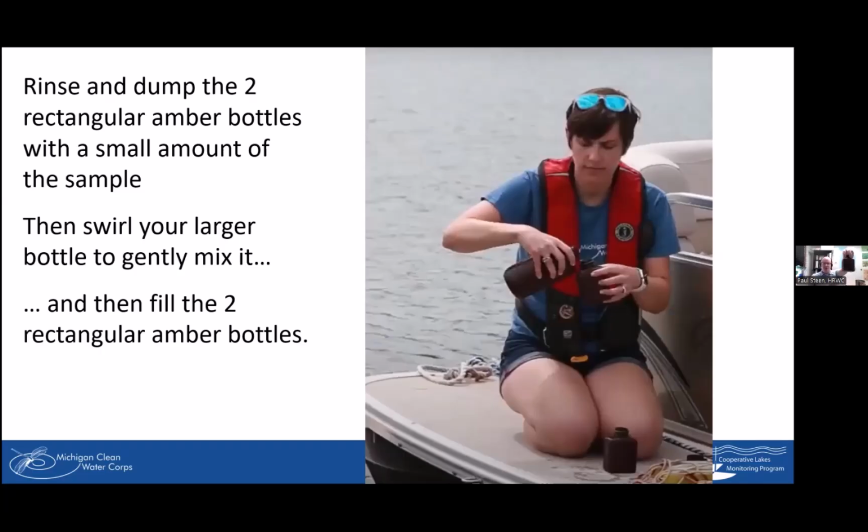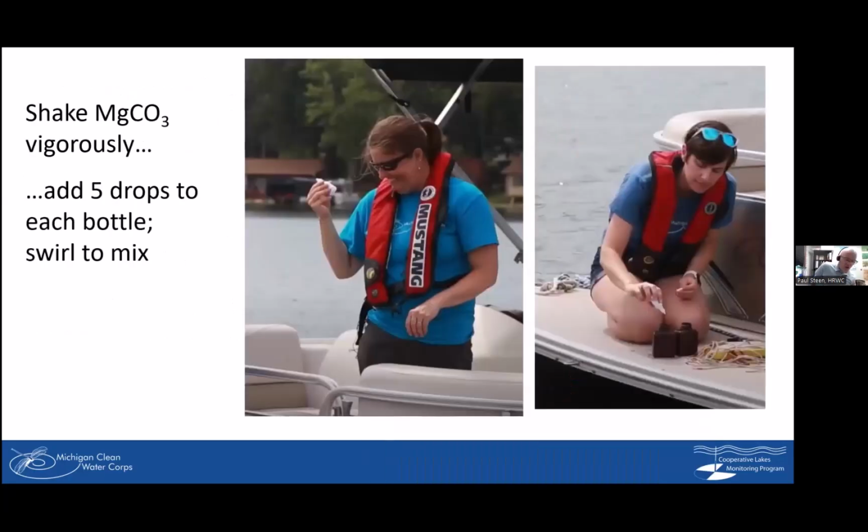Whenever we mix up the chlorophyll, we're always doing it gentle. You could also do this, but you never do that. It's just slow and easy, swirly mixing. What you are allowed to shake up like crazy is this little bottle of magnesium carbonate that we give you.